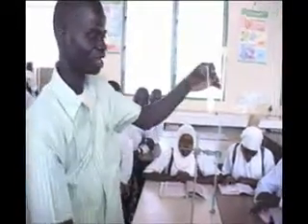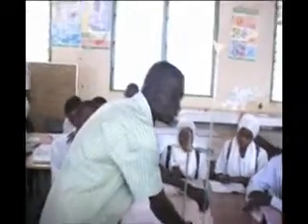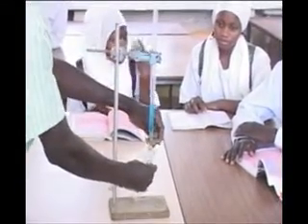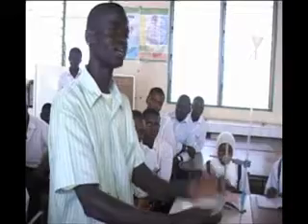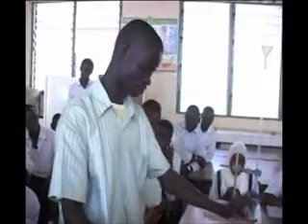Having dropped it in the test tube, we have to shake the test tube and then put it under the burette. So we have to adjust this burette up. When we put it under the burette, we open the burette and shake it. As the mixture is coming down, we are going to see a purple, light blue color formed in that food mixture. That also testifies that protein is present. Protein is one of those materials present in the food mixture. So that's how we test for protein. That's one example of testing for protein.